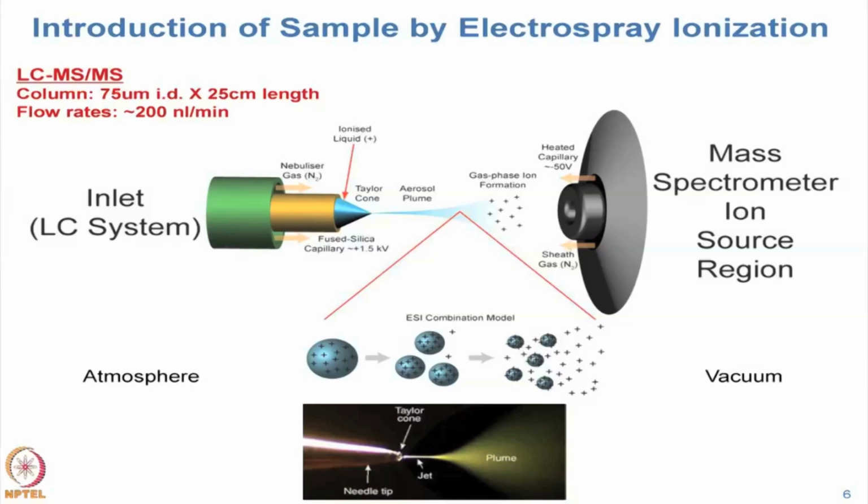As of today in proteomics, there's essentially one major ionization technique that dominates the field, and that's electrospray ionization. If this was 10 or 15 years ago, there would have also been some MALDI, or matrix-assisted laser desorption ionization, but today most of what we do is really driven by electrospray.